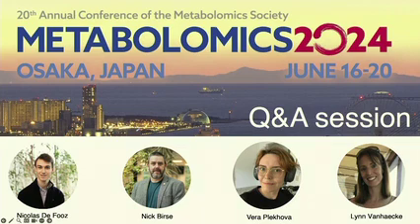At this point, we don't distinguish it. It's just one noise, and we use a threshold to remove it. With Nicolas's approach, there are some distinct peaks that you pick up from all of your data, which is either a peak you expect from biological samples or a peak you don't expect and you exclude them. But for the majority, we just remove every noise feature without distinction. Is it coming from the machine or is it coming from the matrix?